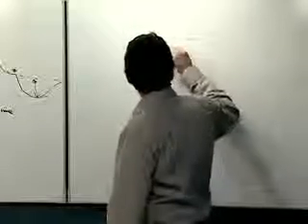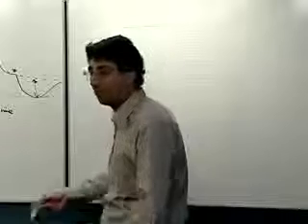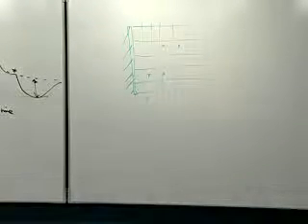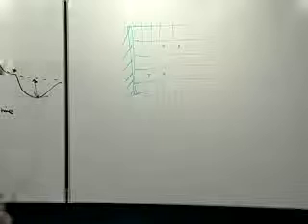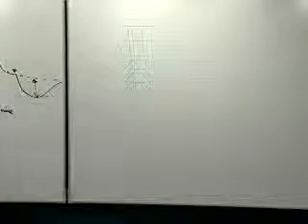But you put a certain number of particles into this space, molecules that are going to be oxidized or reduced. And you tell those particles that they have to follow the laws of diffusion and chemistry, rate constants and whatnot. And you just set the thing into motion and generate a cyclic voltammogram based on a digital simulation.